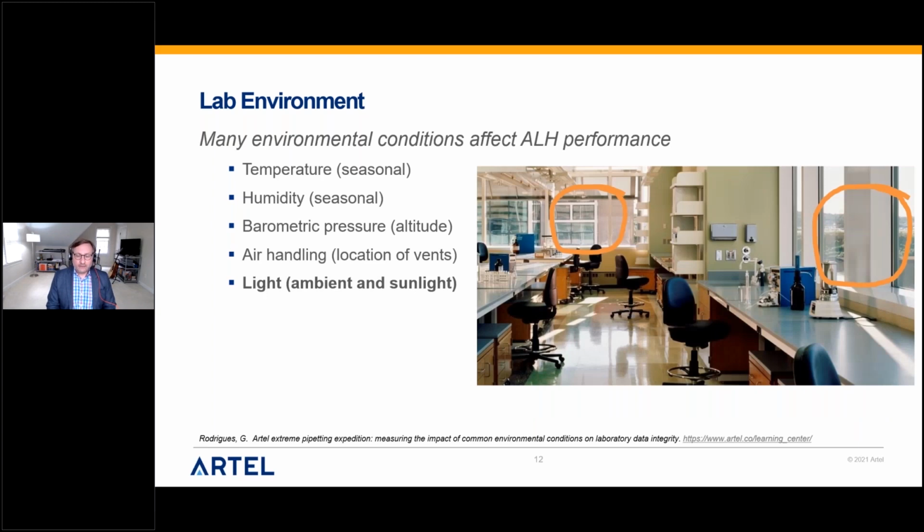Light, that's another big one that people typically overlook. There's the ambient, that's your laboratory lighting. If you set up a system under all these incredibly bright lights in the laboratory, some assays are very sensitive. Fluorescent molecules can photobleach, and there are some assays, the AlphaScreen technology, that are subject to some of the light effects. That's on the assay side.